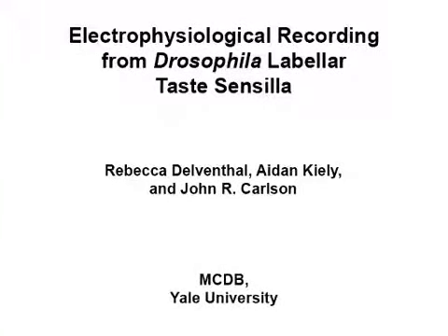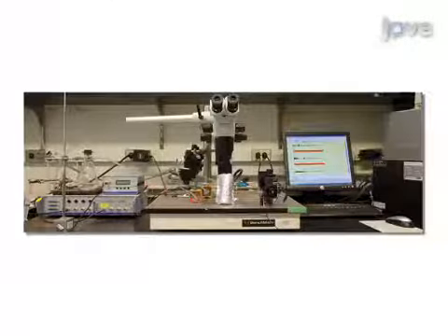The overall goal of this procedure is to measure responses of individual taste sensilla on the labellum of Drosophila. This is accomplished by first building an electrophysiology rig and setting up all the necessary equipment. The second step is to prepare the fly for recording.